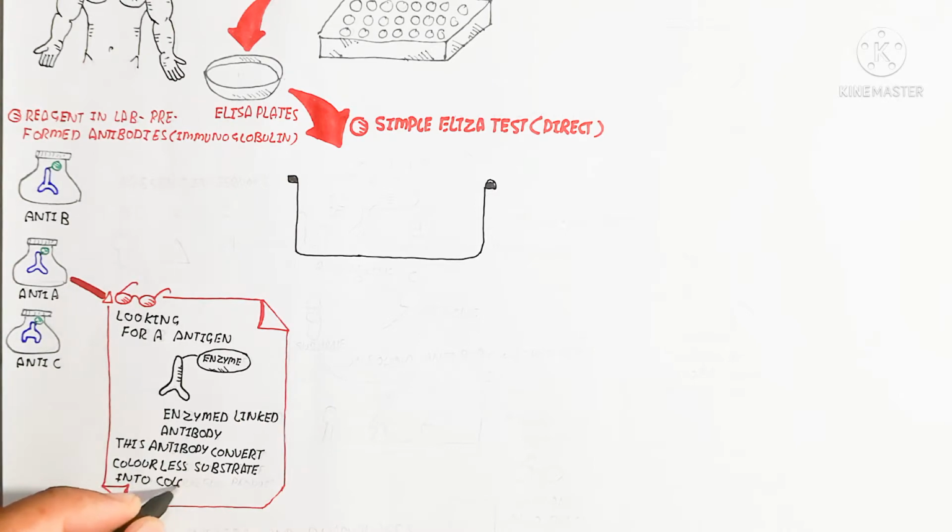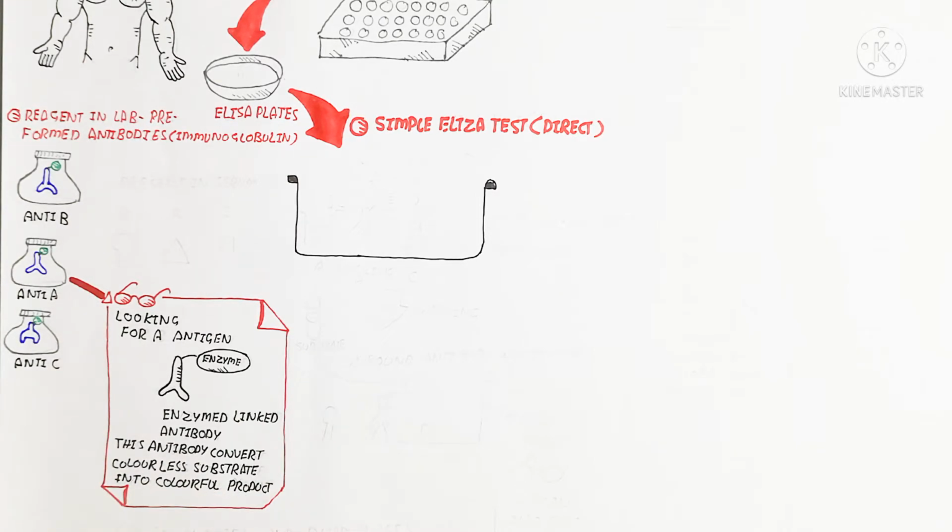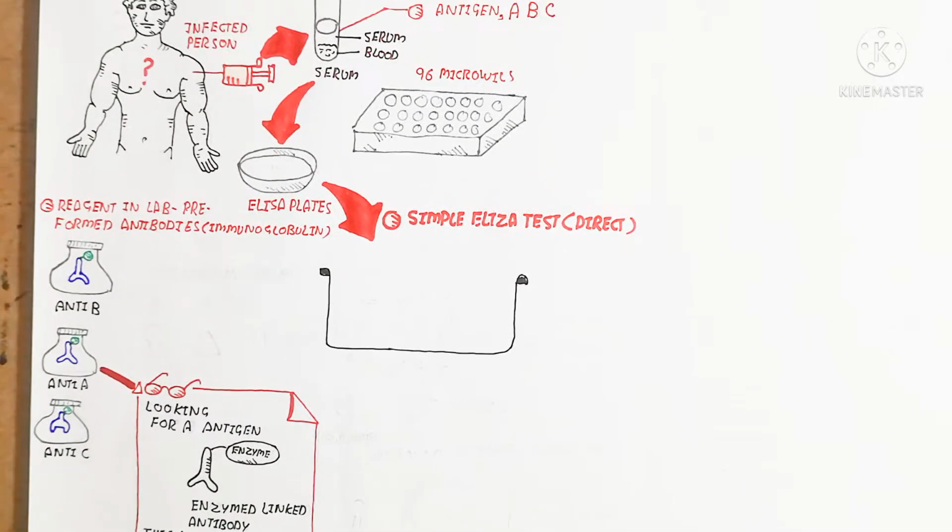Here we discuss the method to detect the antigen whose epitope is present.